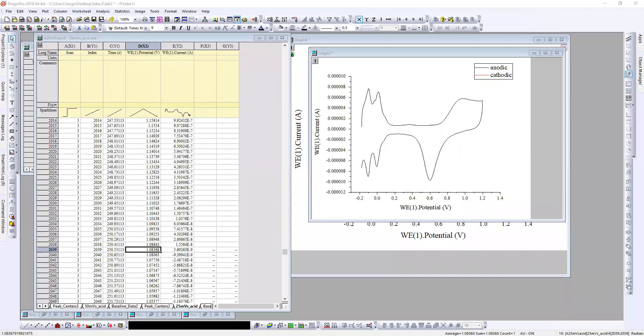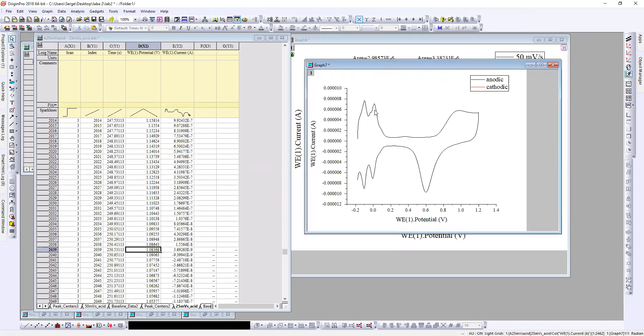So guys, this is Origin software and now I'll show you how great it fits. This is an example.